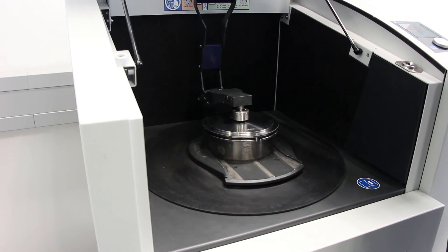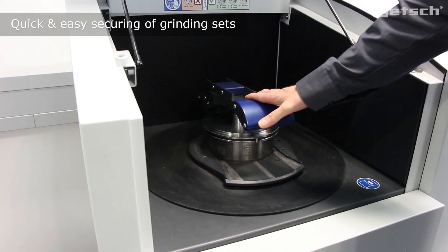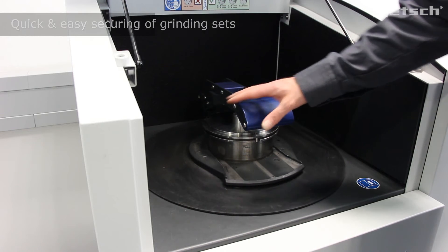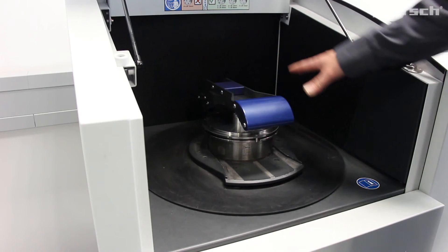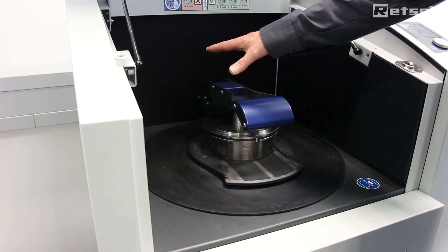We then use the quick clamping device to simply secure the grinding set in place. The grinding set is subject to repeated circular horizontal motions, which is a very powerful modus operandi, leading to very rapid disintegration of the products.